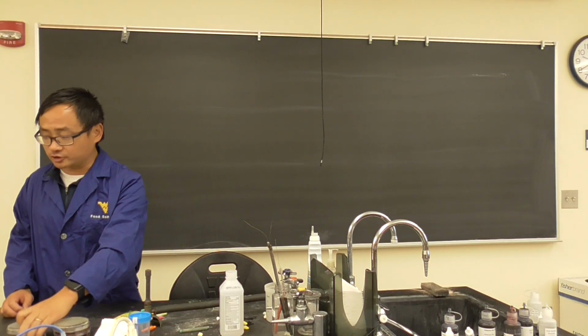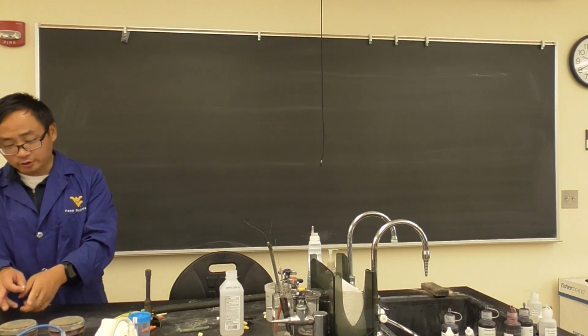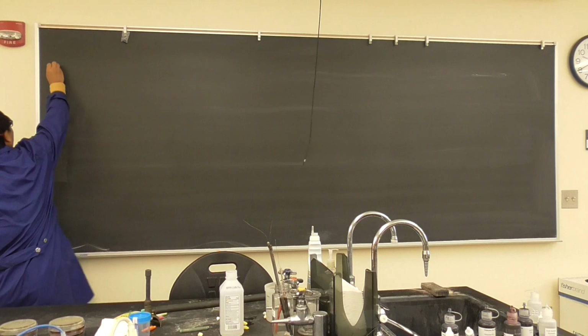First of all, we have 3 patients' results. Are those all 3 patients' results for the urine sample testing? Okay, you have some. Let me talk about something here, then I'll go to your stuff, okay? First of all, we talk about UTI.